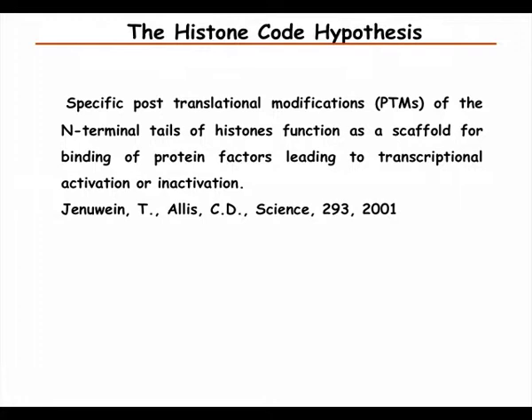No, you can do it different ways. When people look at histones, they usually enrich for the histone. So you focus on one protein and you analyze. If you're interested in one protein to see all the different types of modifications, it's usually better to enrich for the protein.